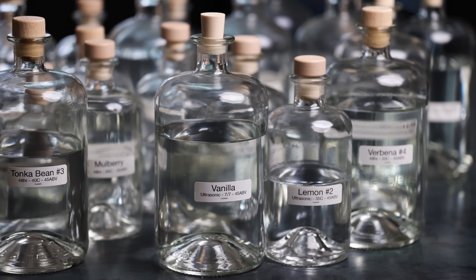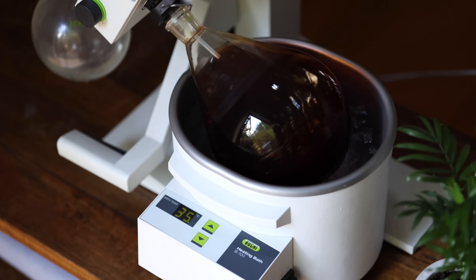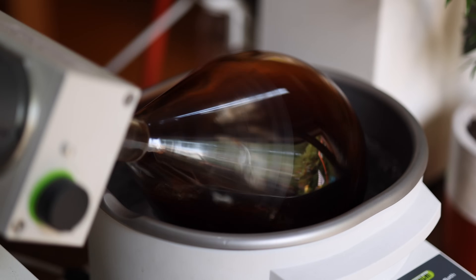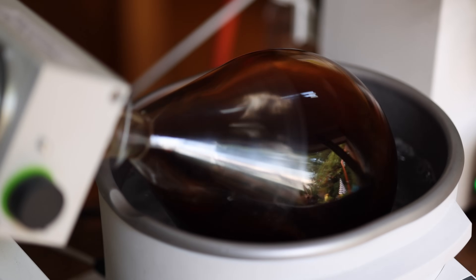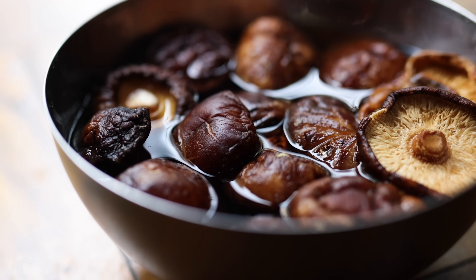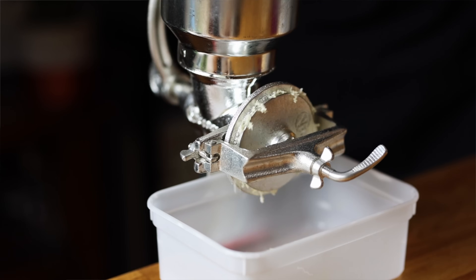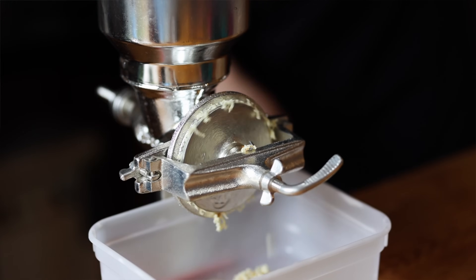This style of working wouldn't suit everyone, and your type of food or distilling just might not need or really benefit from this type of equipment. It's fairly niche, and whilst I think it's brilliant, it comes at a cost that wouldn't be necessary or justifiable for most people. If you're thinking about getting one, you should probably be really clear about what you want it for and whether you truly need it. It's also worth saying this isn't a replacement for traditional techniques — there are tons of relatively simple and traditional techniques I use on my menu too, and really it's all about what gives you the flavor you're looking for.